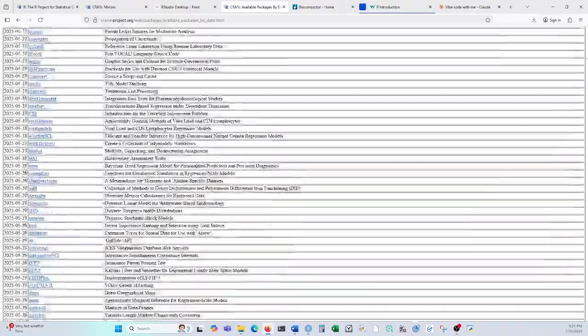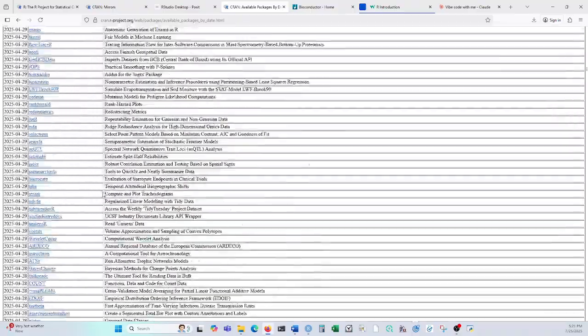So you can see there are a lot of tools R has available to work with, and these videos are going to show you the most basic ones that are useful for lab work and analyzing lab data, molecular lab data.